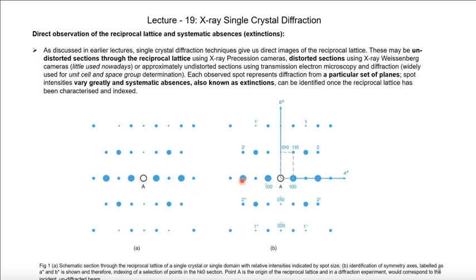And we can see that if we take this section, we have a mirror plane. There is the mirror plane. If we just fold this section, it shows a mirror plane. Also, the vertical one shows a mirror plane too. Do remember this is a schematic diagram, and it is not a diagram recorded from an instrument. Therefore, in an instrument diagram, you might see variation of intensity, but here we are showing symmetrical intensity. So we index it.